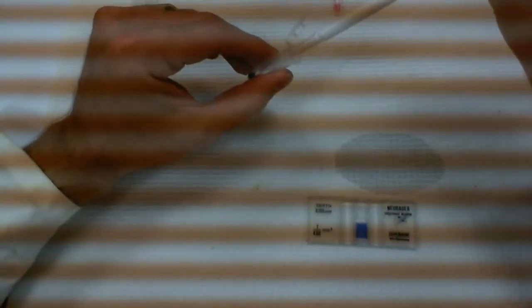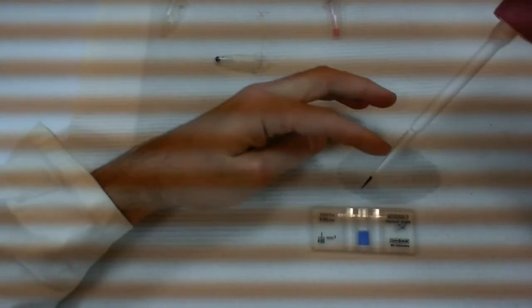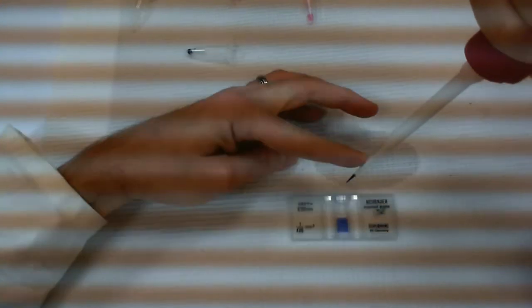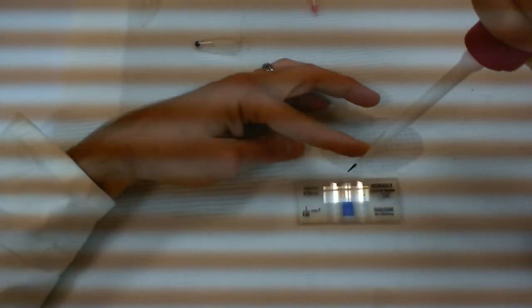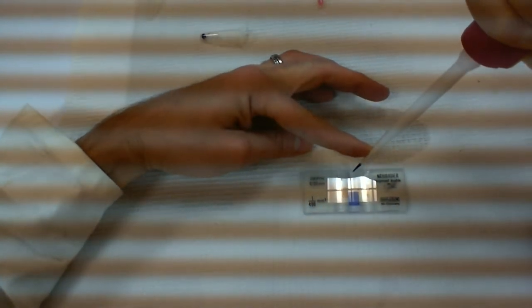So again, I'm just going to put this back in, and I'm going to pipette up and down a little bit, a couple of times, to make sure I distribute these cells well, or suspend them well. And again, I'm going to apply them to the second chamber now. Okay, here, I guess you can see where that cover slip ends. So I'm going to put a drop right next to the cover slip.